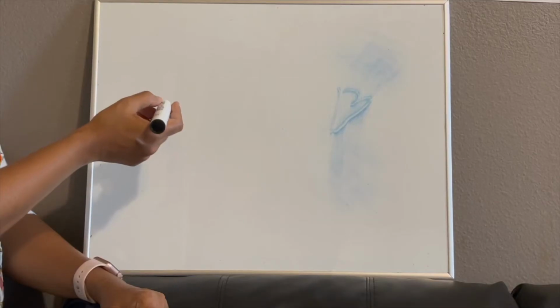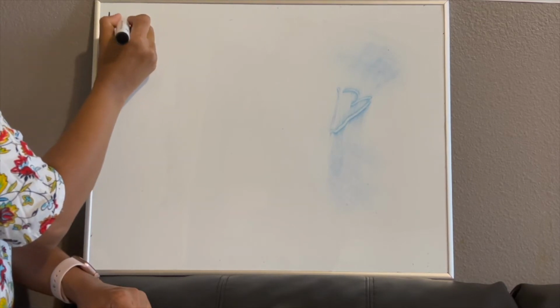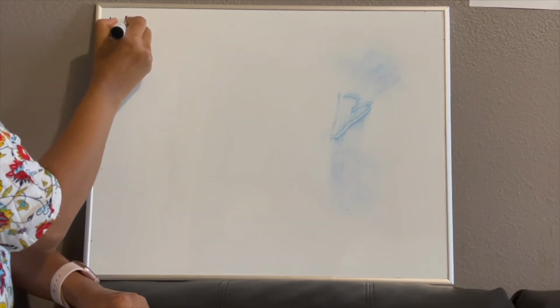I've worked both in India and also in the US in biology labs, and I would like to share some of my experiences of how to make the reagents in the lab. Let's go. Let's dig into some formulas. The first one is percentages.